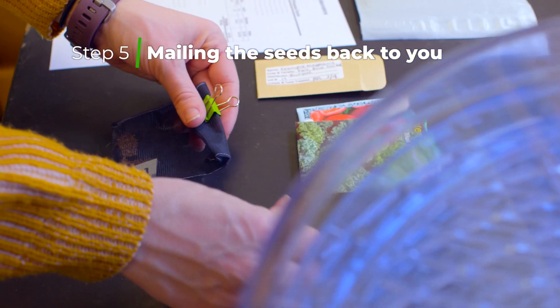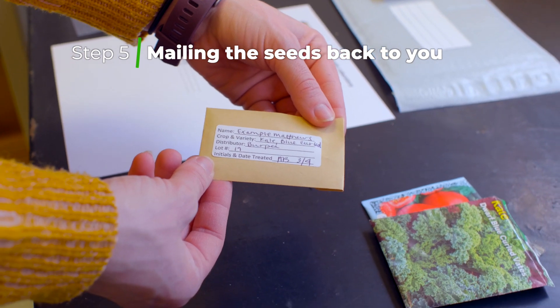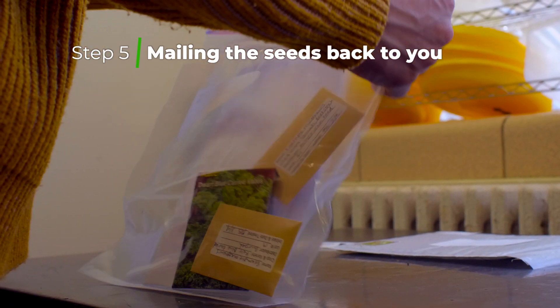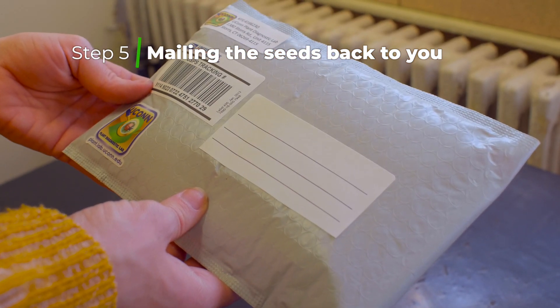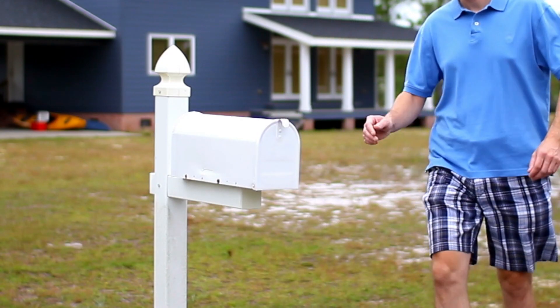The next morning we package the seeds back up in carefully labeled envelopes, include your original seed packaging, and affix a USPS tracking label so you can track the package, then ship it right back to you. It's that easy.